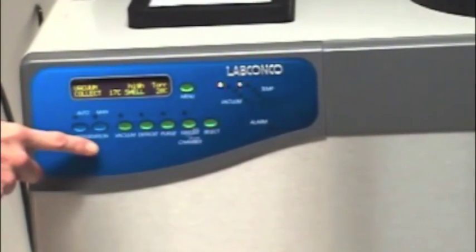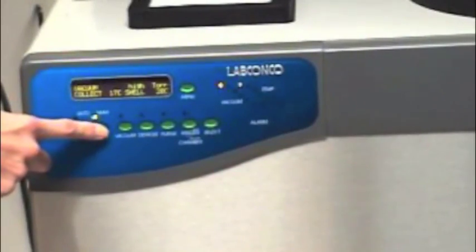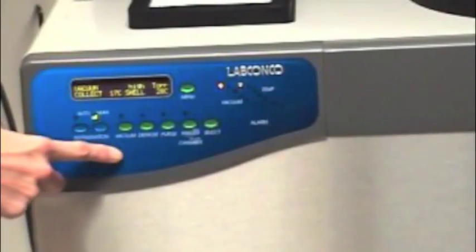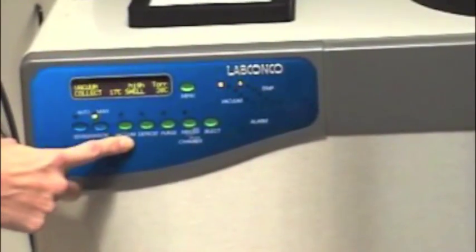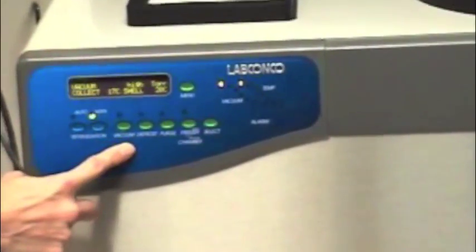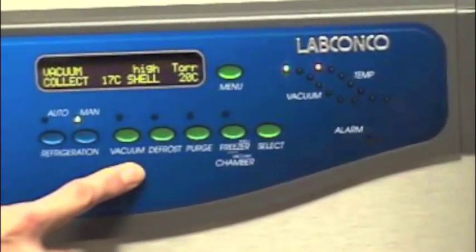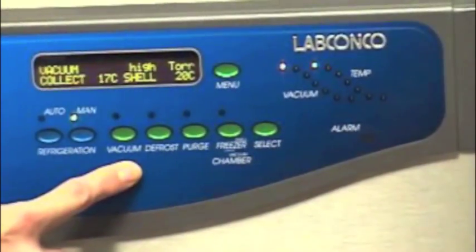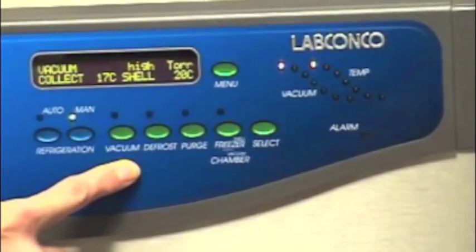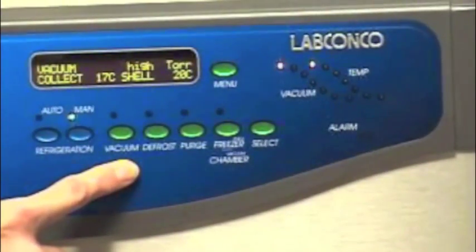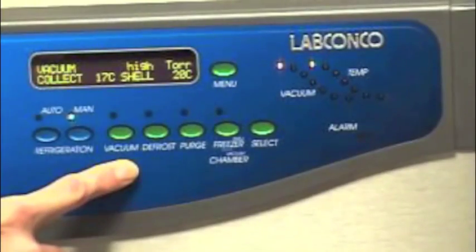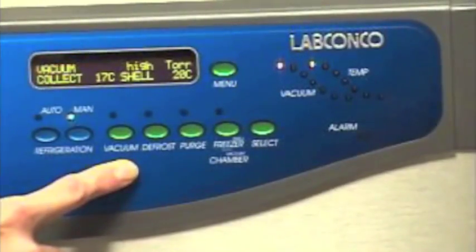Once the parameters are determined in manual mode, the stoppering tray dryer can be programmed for automatic mode. To program automatic mode, turn the base unit refrigeration on using the refrigeration button in manual mode. Make sure the vacuum LCD light is off.